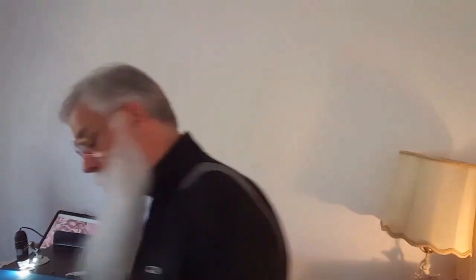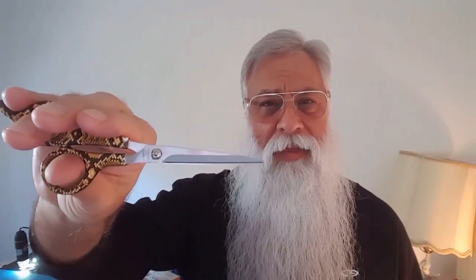I took some beard hairs out of a brush and taped them in a line, labeling each hair on a piece of blue tape. There are six hairs, and I'm going to cut each one with a different tool. The first is a pair of Walmart shears — my humble first pair, going back a bazillion years. Just cheap hair cutting shears, cost me about $12. I'm going to cut a hair with them and then microscopically look at the cut.